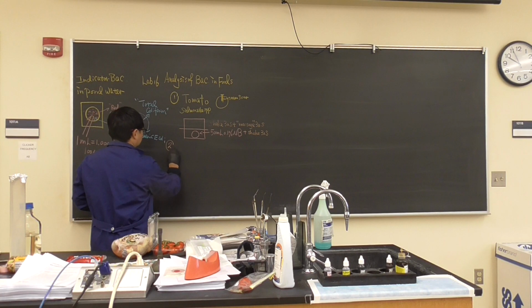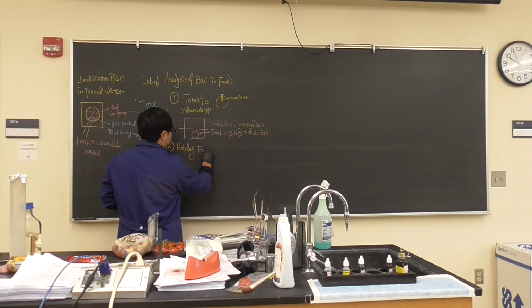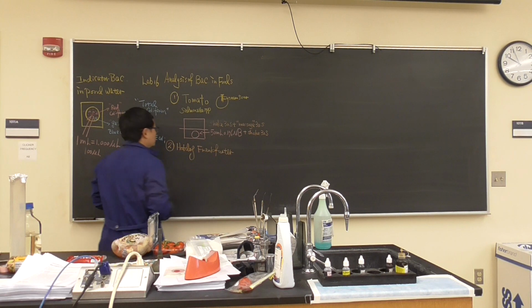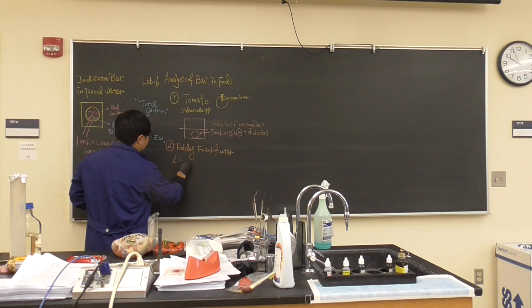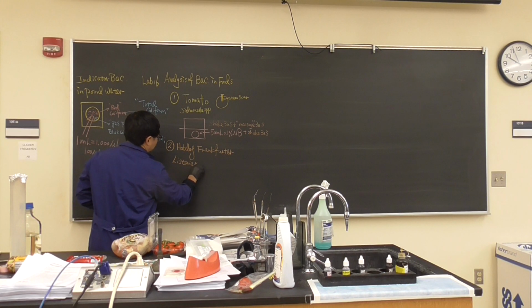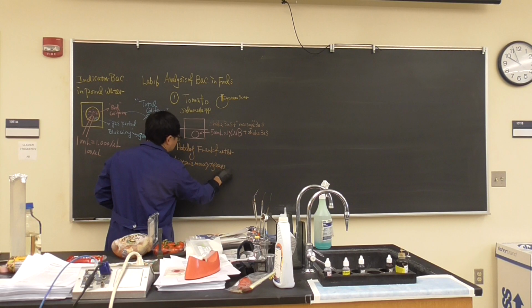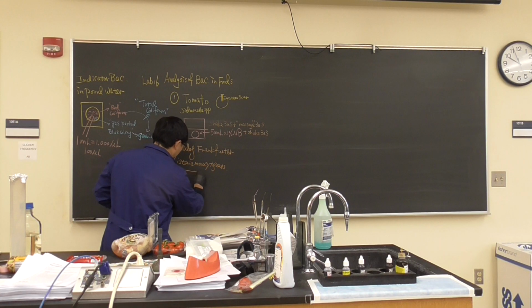The second thing, the hot dog, or we sometimes say frankfurter. The risk for the pathogen is Listeria monocytogenes. That's related to outbreaks a lot. We'll talk about it in the lecture. So the same thing, we're going to add 1 hot dog into the bag.